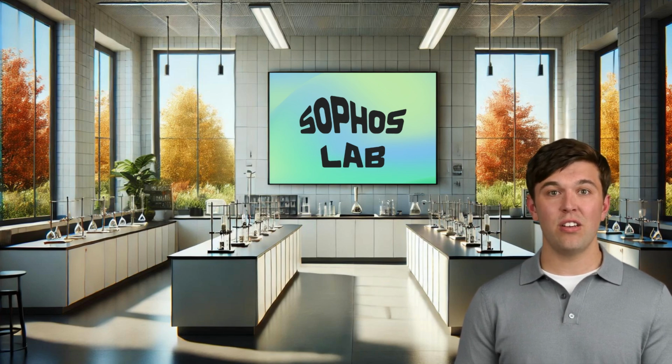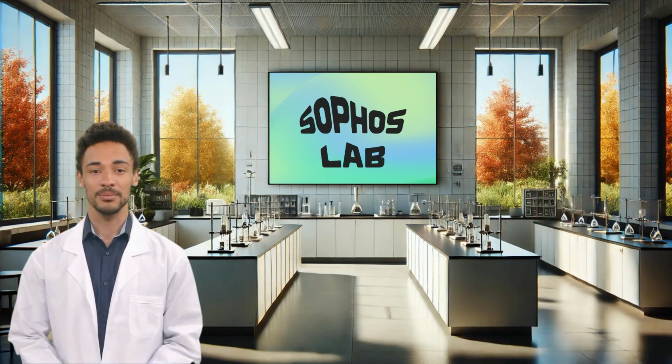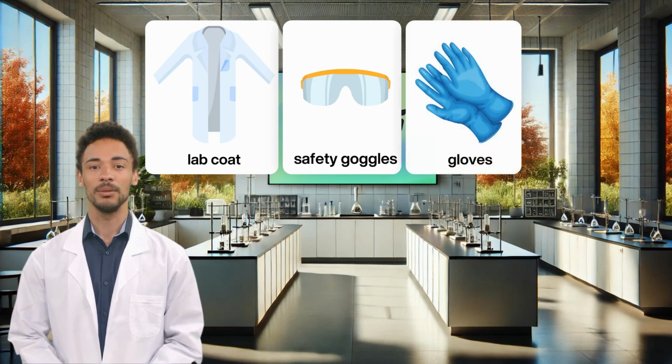covering. But first, over to Sam, our lab technician, to outline what safety equipment we need. Hi everyone, I'm Sam. Before we get started, make sure to put on your lab coat, safety goggles and gloves. Remember, safety is our top priority in any lab environment.